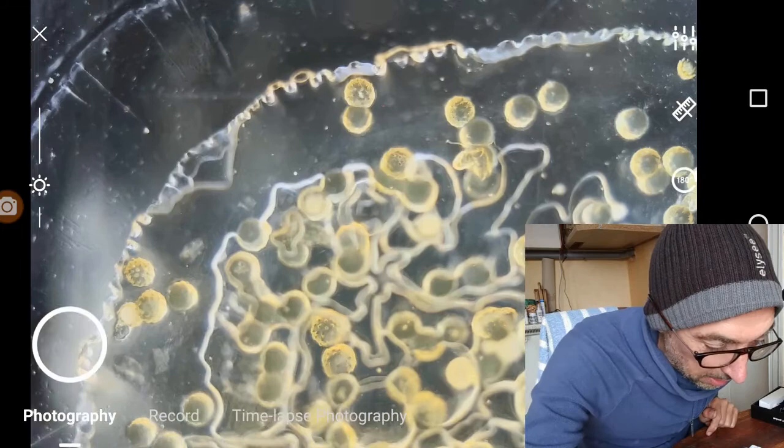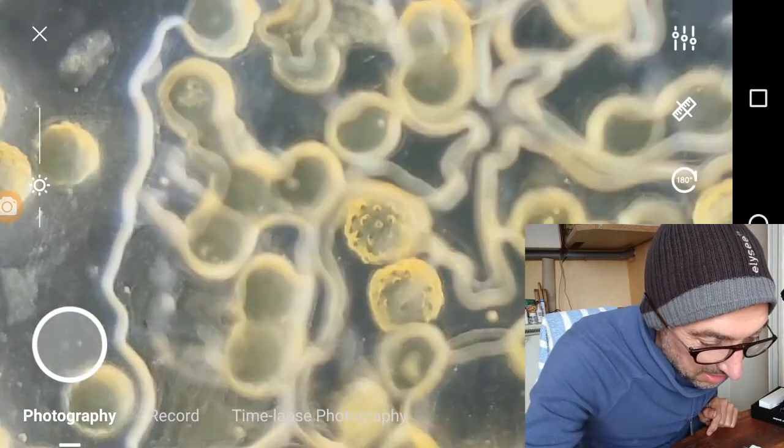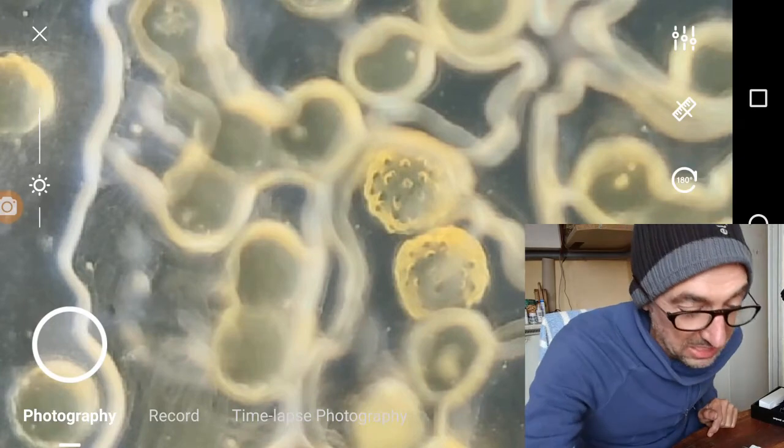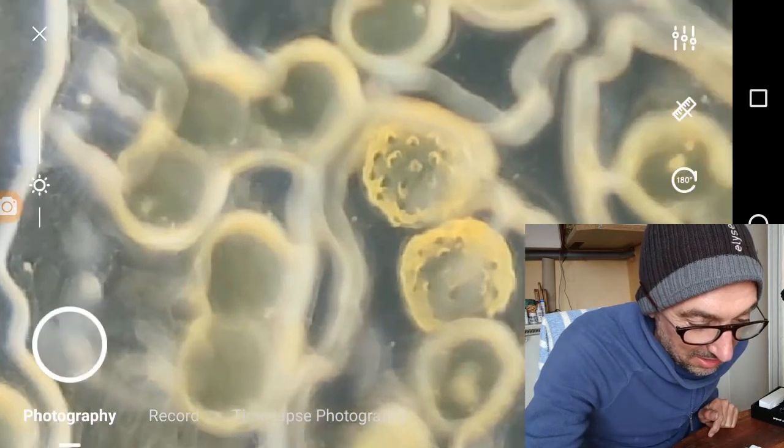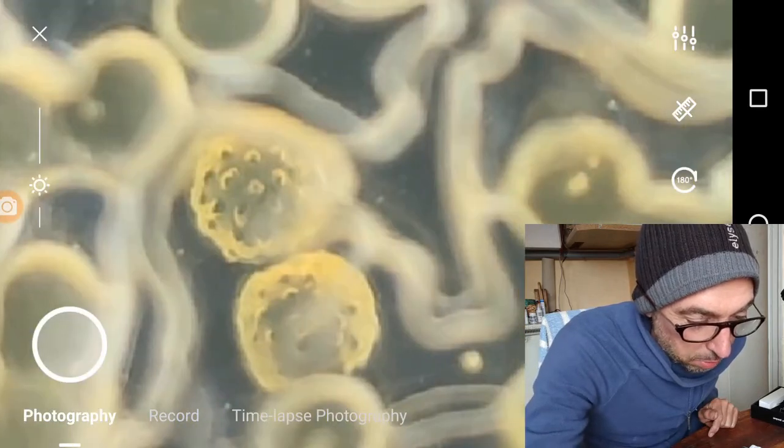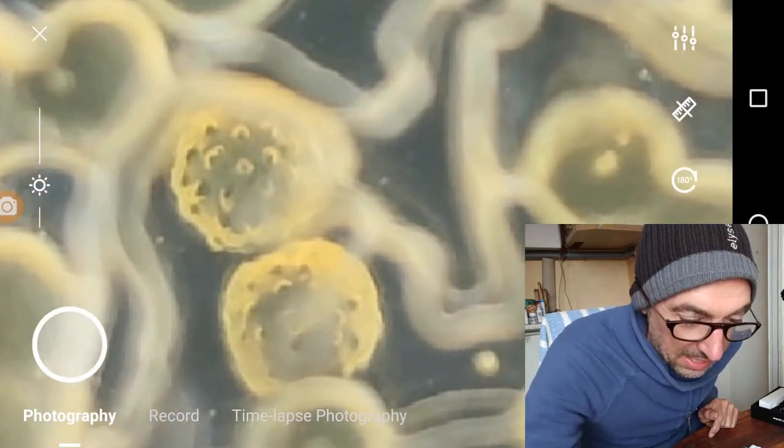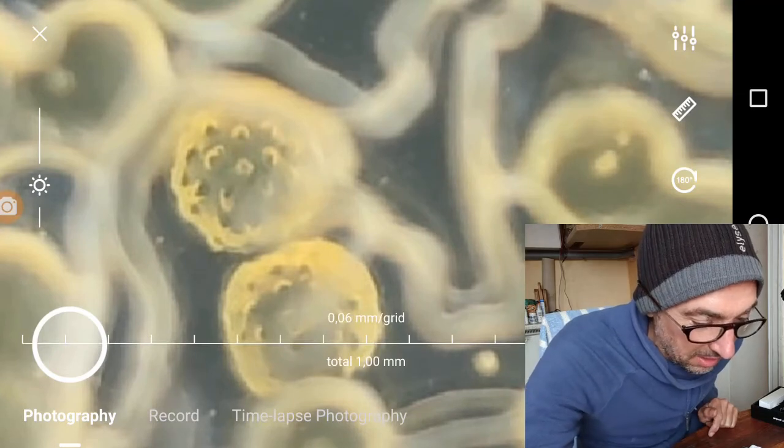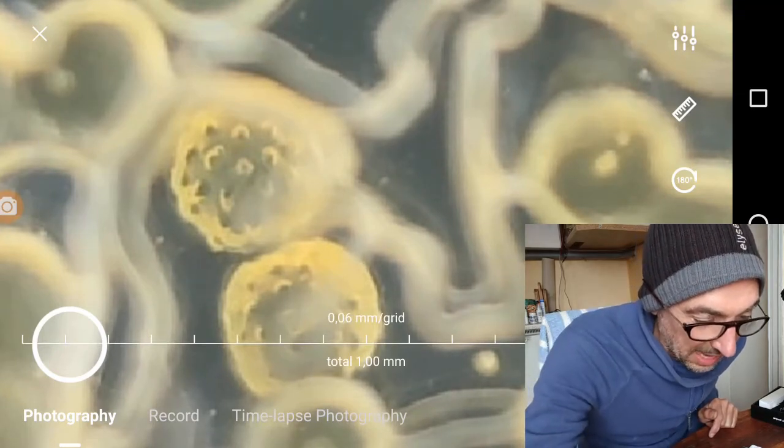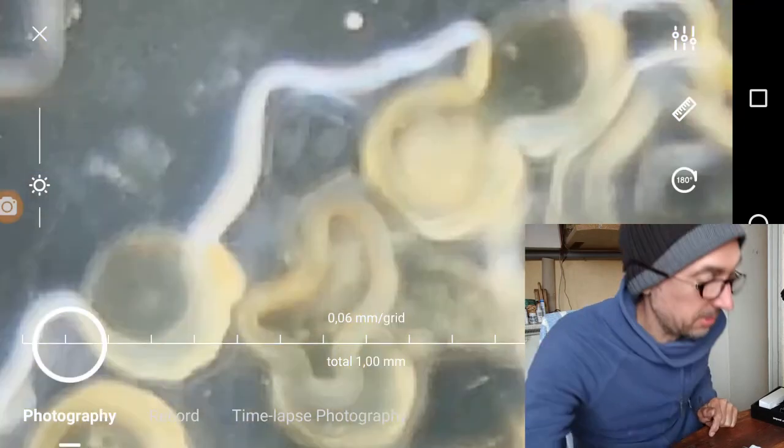The pixel tool does not work for now. Here you see at 1000x magnification you can zoom in digitally. This is what I want you to compare - this pollen versus these spikes. Very nice, we have this grid ruler to see the size.